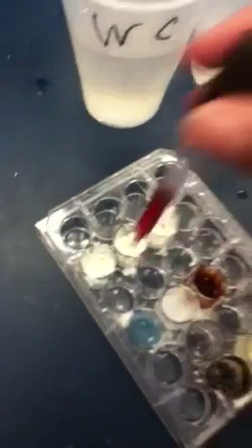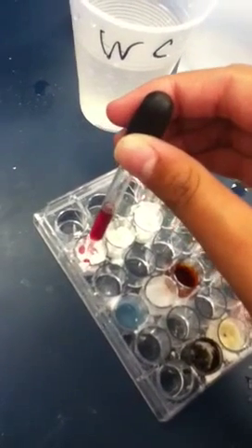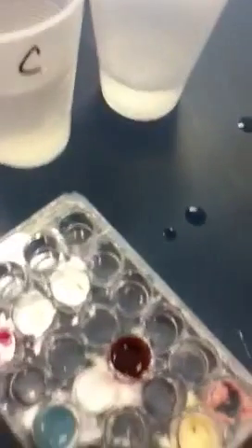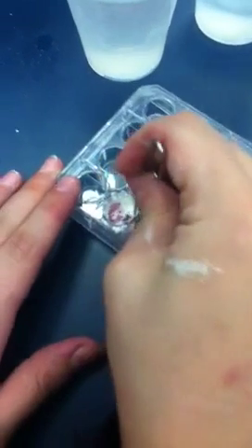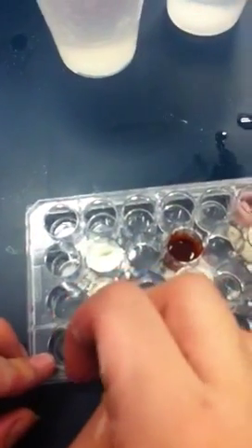Now let's pour in the cabbage juice. Ready? This is actually very comfortable. How do you test pH on powder? Stop asking questions. You're gonna make us look non-smart. Yeah. Ashley, please mix it. It was really cold. Whoa. It's like not oily.